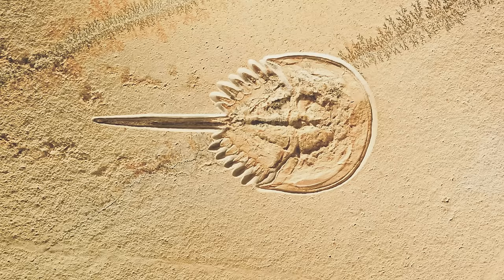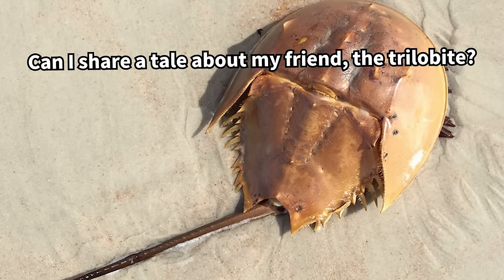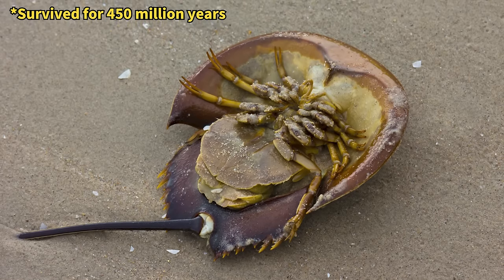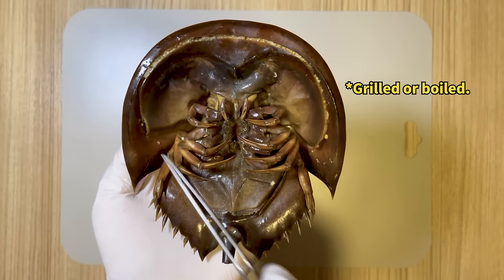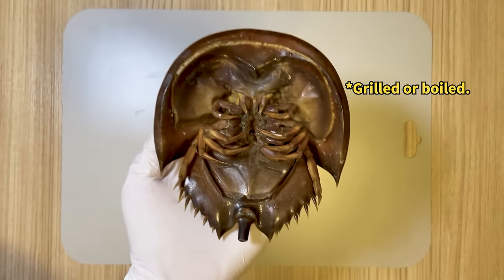Horseshoe crabs are often called living fossils because their appearance has scarcely changed from the Paleozoic era to the present. Surprisingly, even these enduring creatures with their long history have found their way onto the dinner table in Thailand. Horseshoe crabs sold in seafood markets are typically cut open, and the eggs inside are cooked and consumed. I'll showcase the horseshoe crab eggs later.